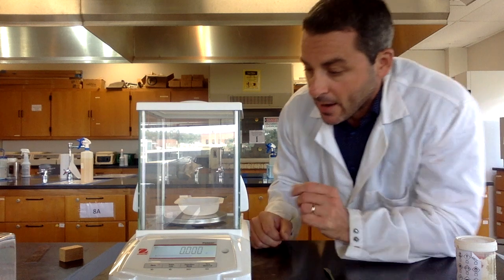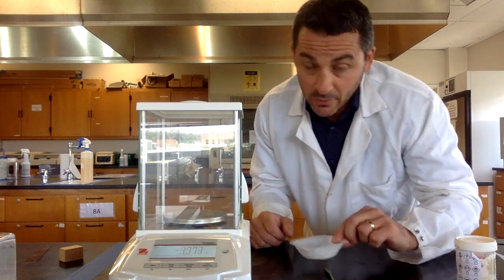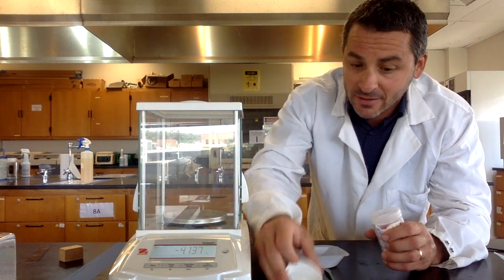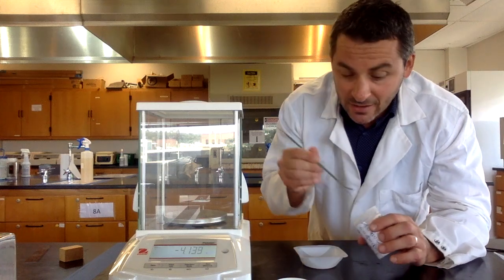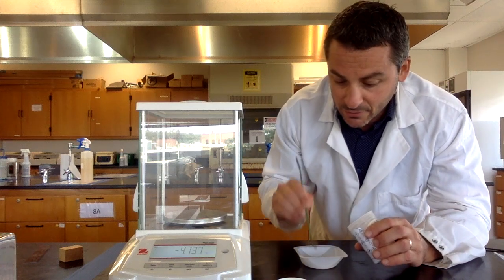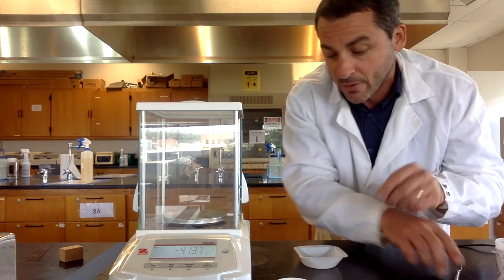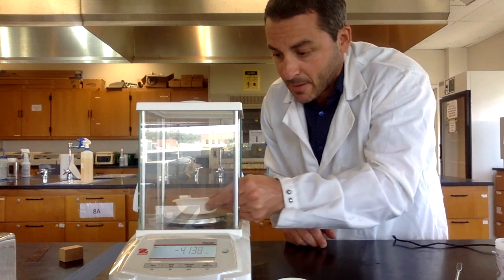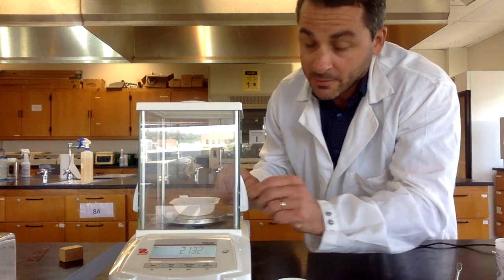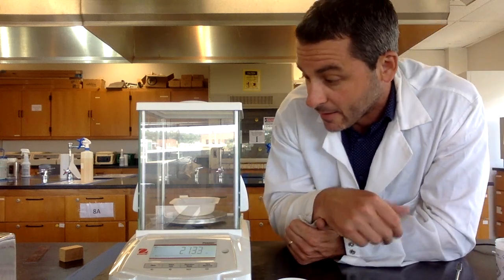Then when you want to weigh out your solids, you take the weigh boat off of the balance. We don't add solids on the balance because that makes a mess. You take a spatula and you spoon some of your solid material into that weigh boat. Then you put the weigh boat back on and now the mass on the balance is the exact mass of the solid only.